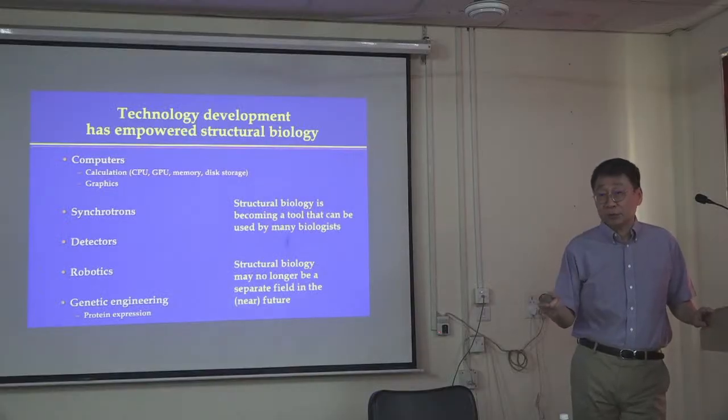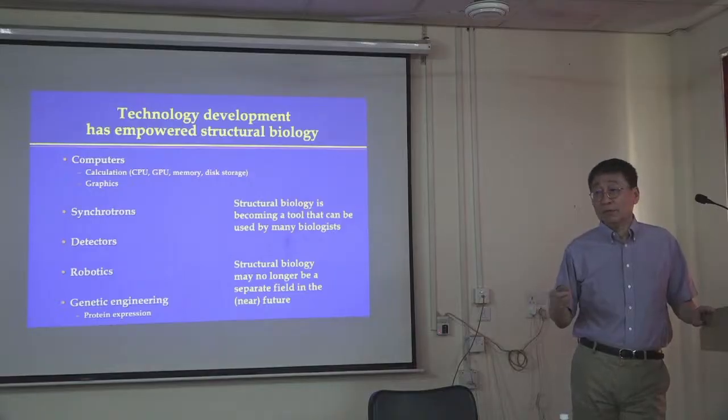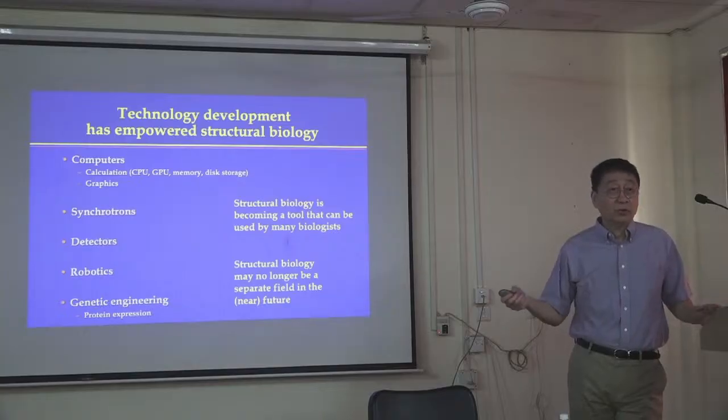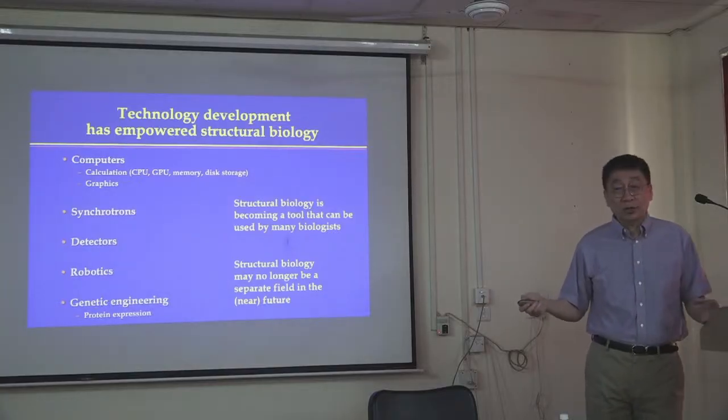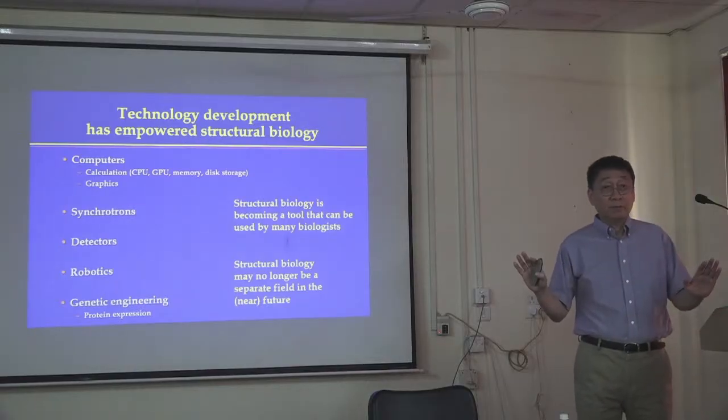Just like biochemistry or small molecule crystallography, which used to be a field on its own in the 1950s or 60s. Now it's a tool. There are companies you can send your molecule to and they'll get your structure. Everything okay so far? All right.